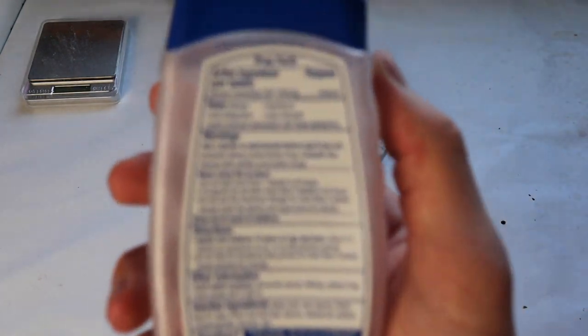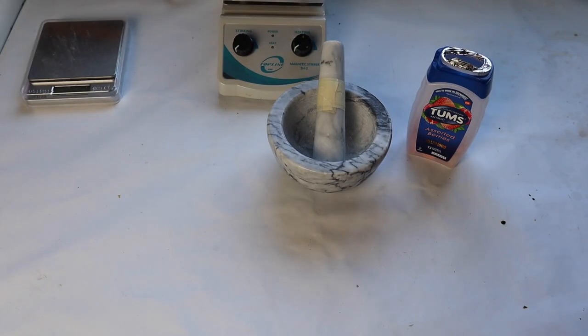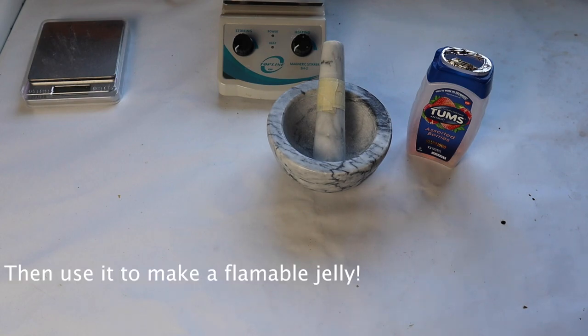The active ingredient in Tums is calcium carbonate. In this video I'm going to extract the calcium carbonate, relatively impurely, and then I will convert it to calcium acetate.